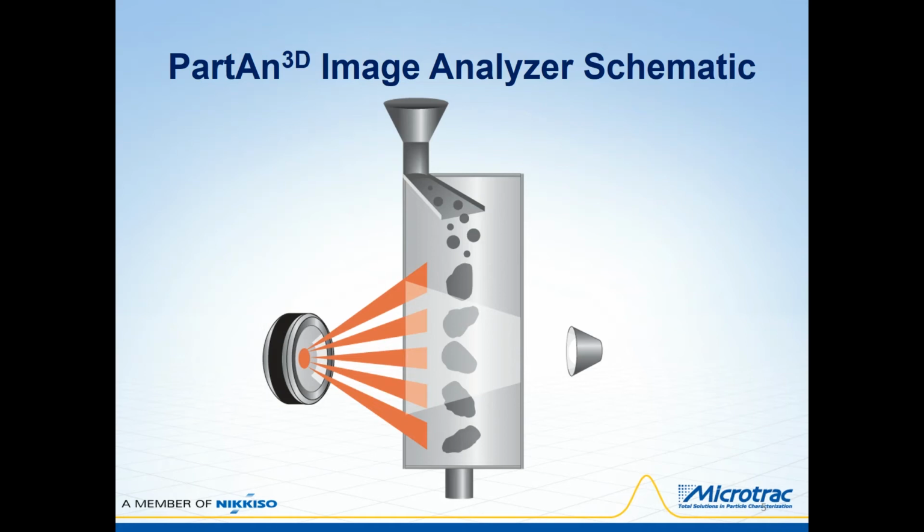A video file of the analysis is stored, and distributions and summary data for upwards of 30 morphological parameters, which include sizes, shapes, and transparencies, for each particle are calculated and reported.